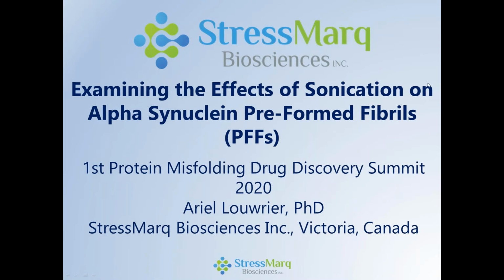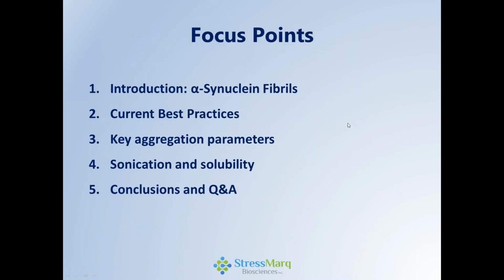Today I'll be giving a talk about the effects of sonication on a-Synuclein preformed fibrils. I would like to thank the meeting organizers for this opportunity. We will start by looking at a brief introduction of a-Synuclein fibrils, followed by current best practices of using them. We'll then examine some of the key aggregation parameters, and then look at some of the work we've done with sonication and solubility. We'll then conclude and take any questions from the audience.